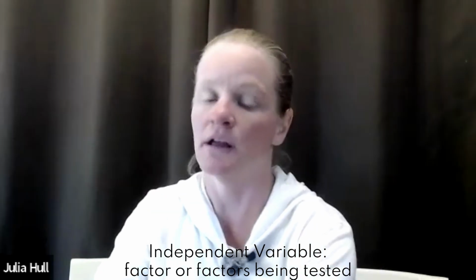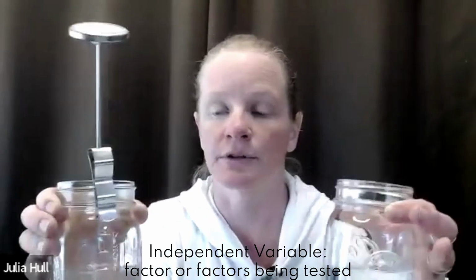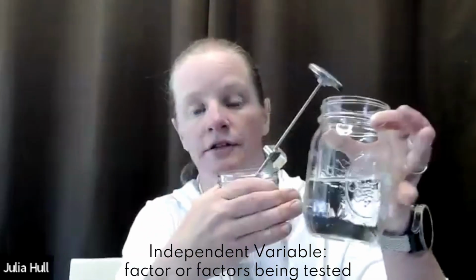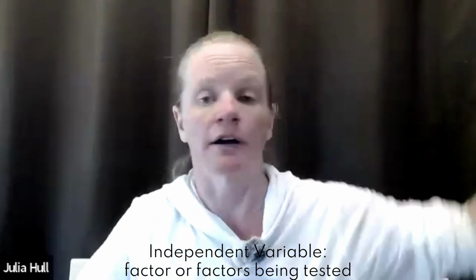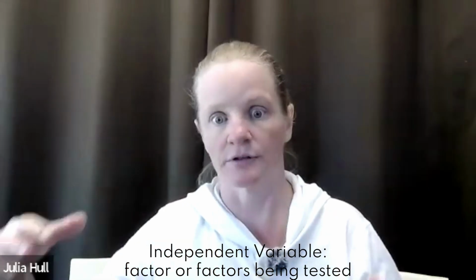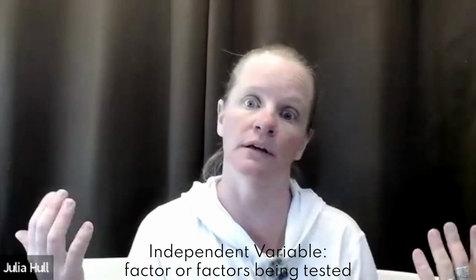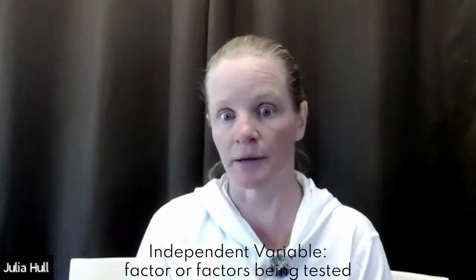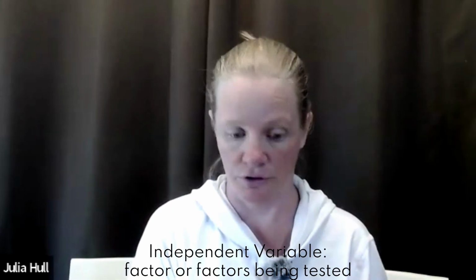In my setup today, my independent variable is going to be different temperatures of water. Here I got some hot water. This is just lukewarm water. And then I've got some water in the freezer. So these different temperature treatments are going to be my independent variable. I'm testing the effect of temperature on the rate of diffusion.